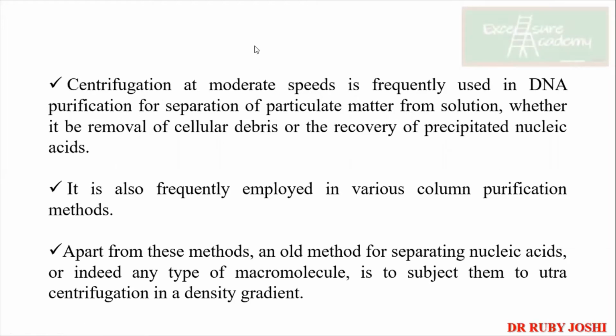Okay, let's go. Ma'am, why do we have to isolate the nucleus itself, ma'am? See, that's what, there are different ways. If I wanted to work on the nuclear protein only, then I will not disrupt the entire cell. Suppose I am interested to work on the nuclear protein. If I rupture the entire thing and the DNA, RNA, everything comes out, then this nuclear protein which is present, this is the cell, this is the nucleus, the proteins present over here during the purification will get mixed with the cytoplasm, it will get mixed with the nucleoplasm. So the load of purifying protein will increase. Correct?